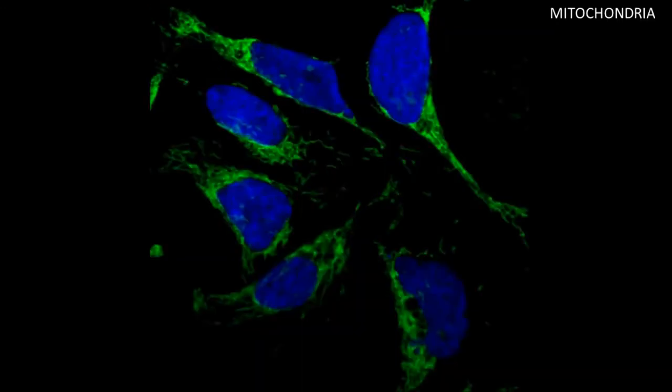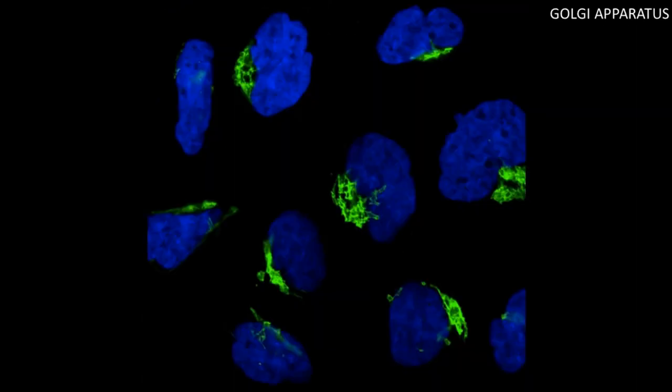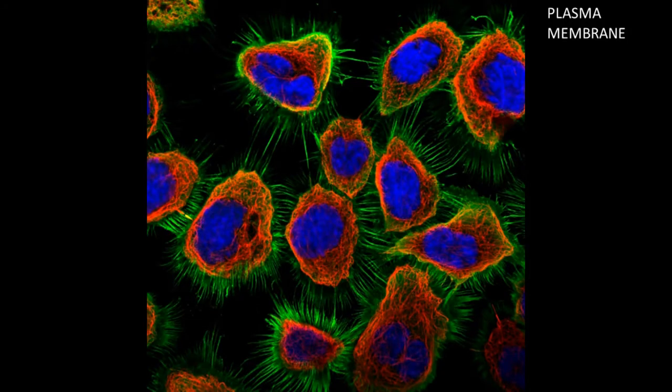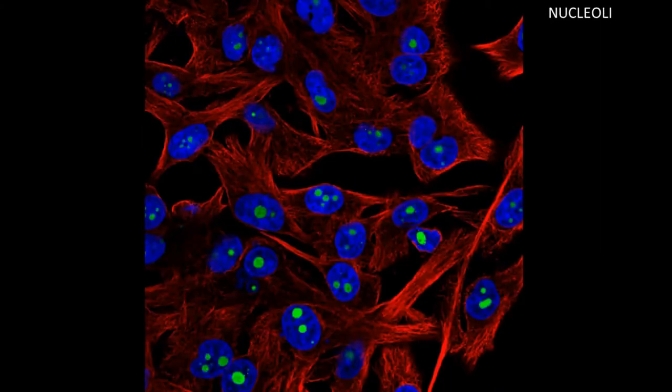This is a mitochondrial protein. This protein is localized to the endoplasmic reticulum, the Golgi apparatus, the plasma membrane, the nucleoplasm, nucleoli.